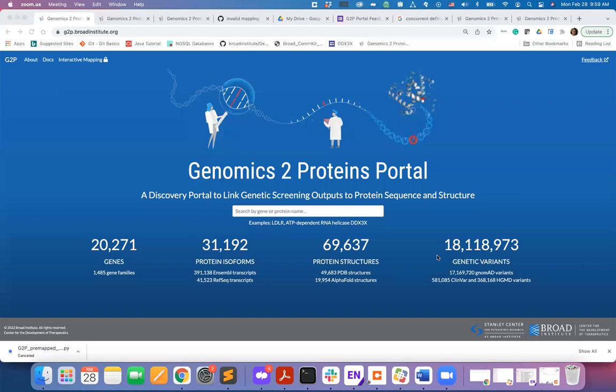Hello everyone. In this video, I will give you a brief overview of the Genomics to Proteins, or G2P, portal and its capabilities. It is a discovery portal to link genetic screening outputs such as genetic variations or perturbation scores on protein sequence and structure.